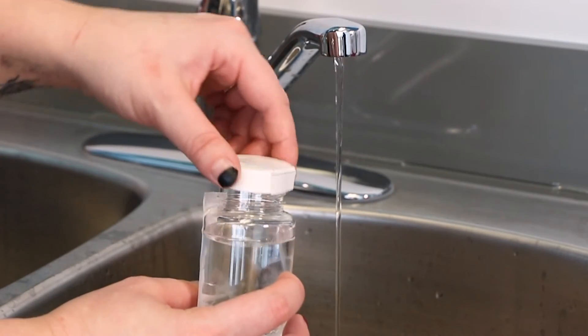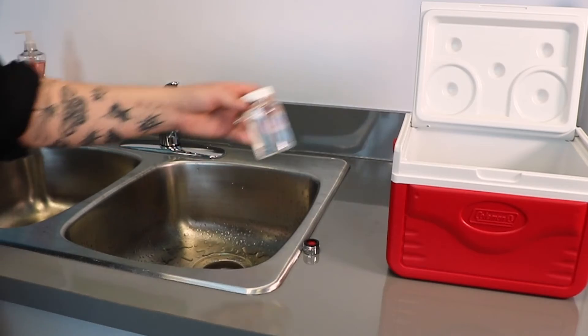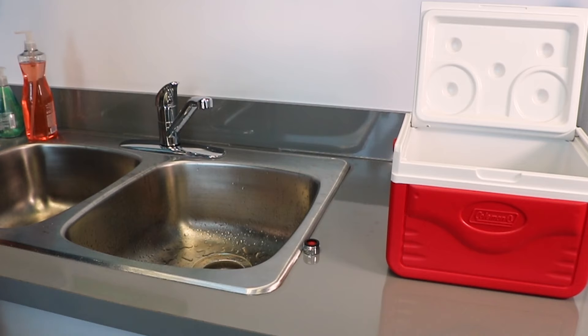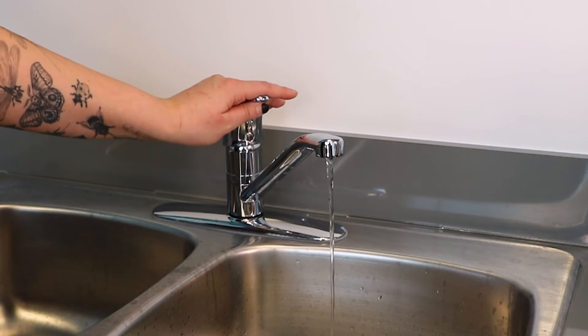Replace the cap on the bottle as soon as it's filled, and place the sample in your cooler. If you drop the cap or bottle, or contaminate the sample bottle in any way, start the process over with a new bottle. To conduct chlorine residual sampling, please refer to the video called 'How to use a chlorometer to measure chlorine residuals' — it's part of this video series. Turn off the water and replace any attachments you removed.